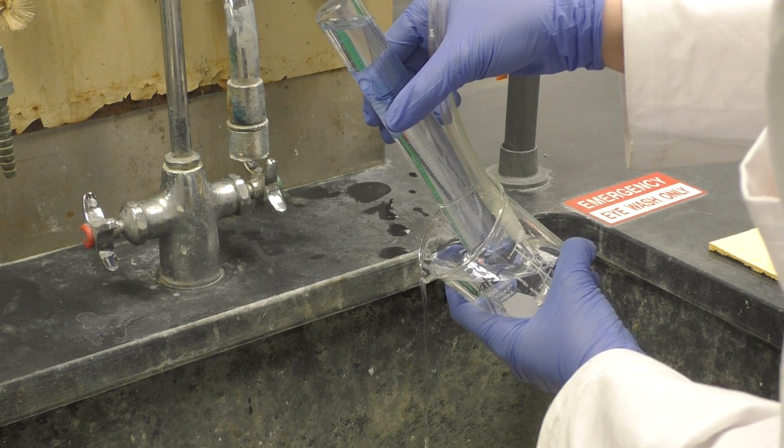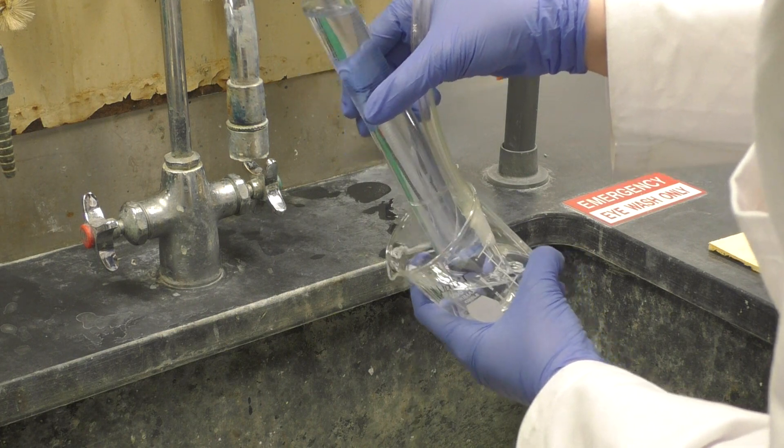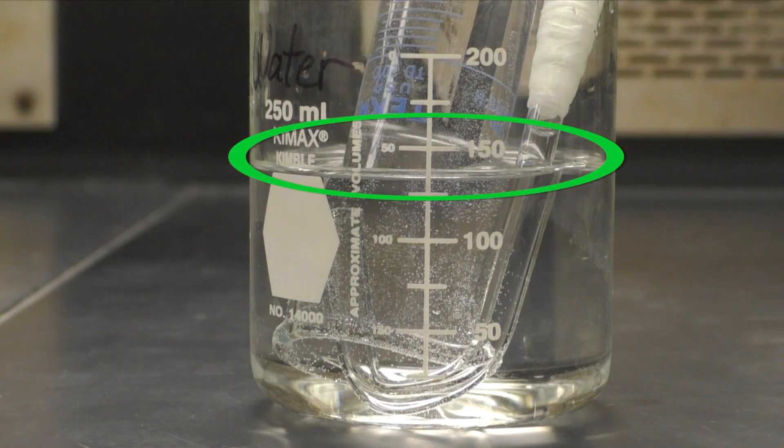Finally, hold the graduated cylinder and J-tube in place while you empty out the water from the beaker until the water level is just below 150ml.